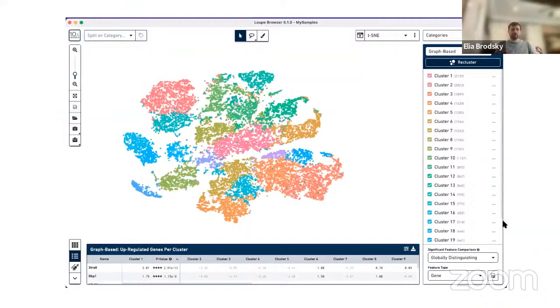Now, the attempt to reduce the complexity of the analysis to a more user-friendly interface is only as useful as the logic behind your analysis. Your logic has to be solid, and then you can use it effectively. This particular interface is useful, but it can be misleading when you have to adjust for factors, right? This is going to jump directly from here's your raw data, here are your UMI counts, here's your visual like t-SNE or UMAP. What you're missing is the ability to address the technical issues before you get to this step.